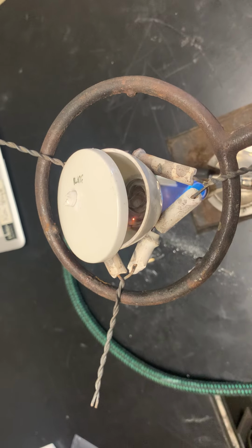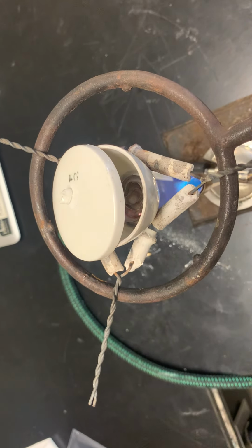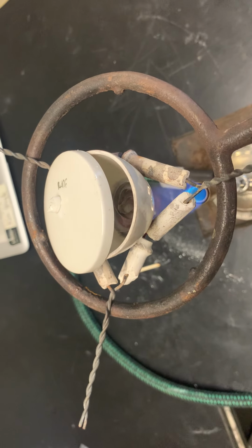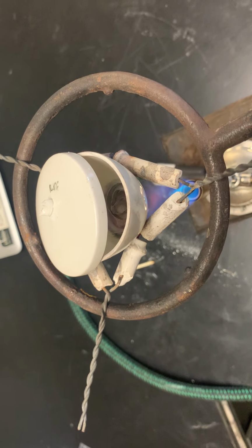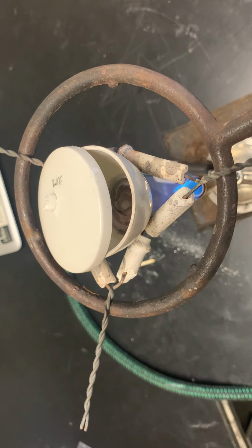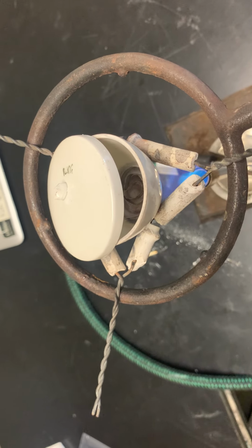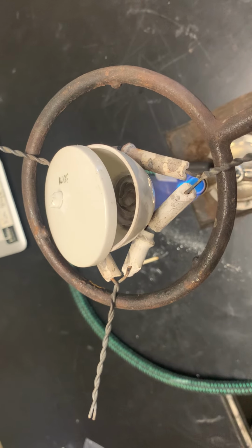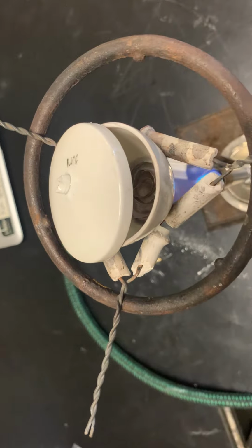There we go. I really think I need to increase the heat. So have some sparking. This is a reaction with oxygen, so another reason to have the opening, the lid opening, is to allow oxygen in so that it reacts with the magnesium.